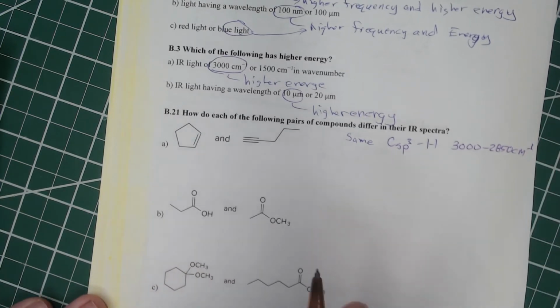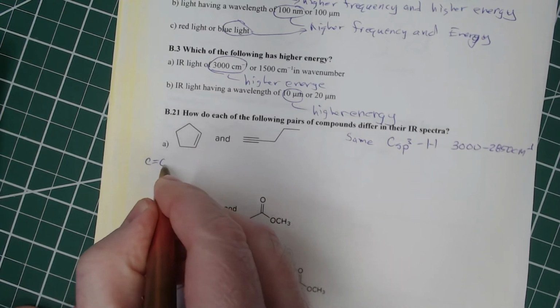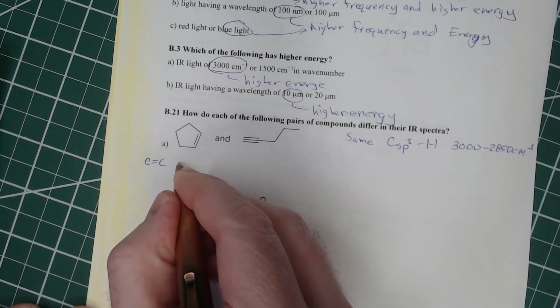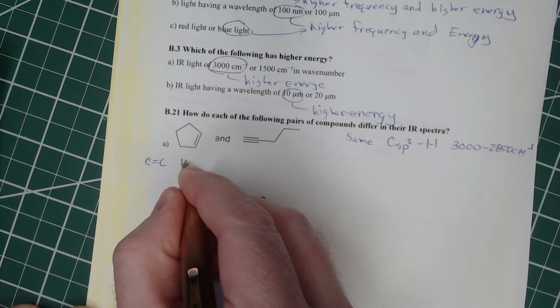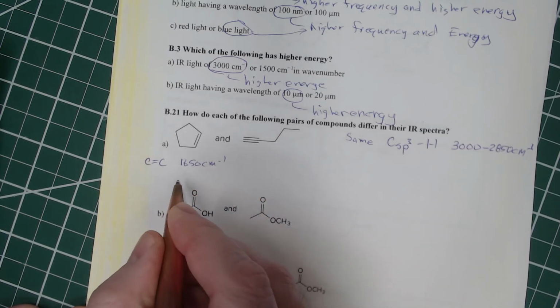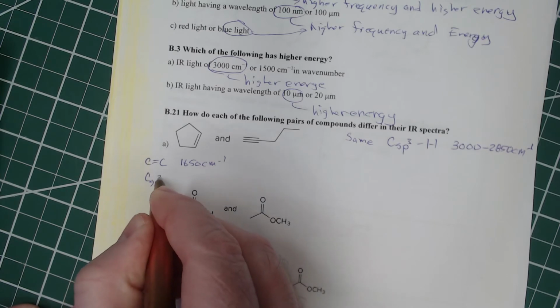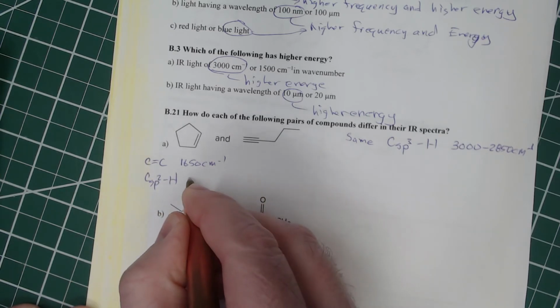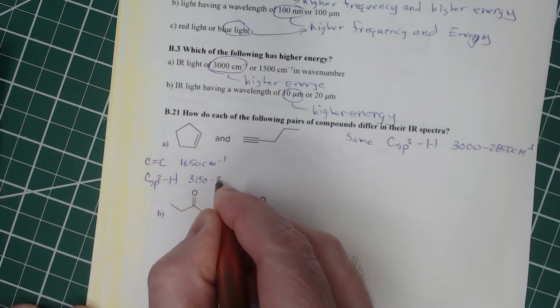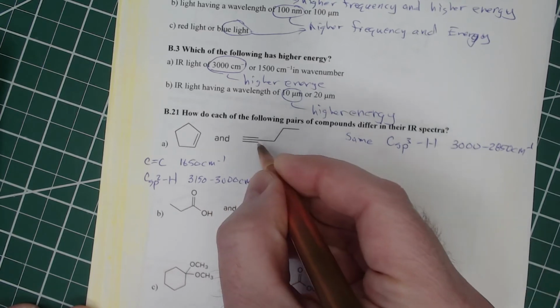Okay. Now, how are they different? Well, this one has a carbon-carbon double bond. And if you go back and look at that chart, you'll see that it has an absorption at about 1650 reciprocal centimeters. And then we also have a carbon sp2 hydrogen, which will be from 3150 to 3000 reciprocal centimeters.